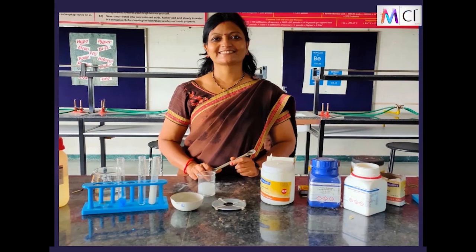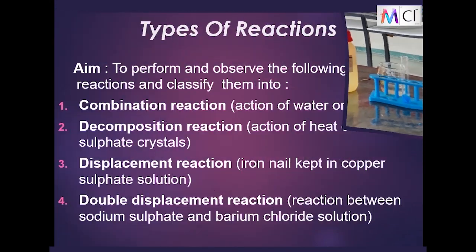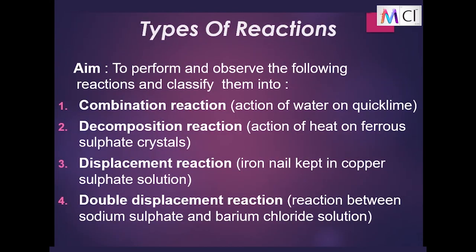In this presentation, we are going to focus on the practicals of types of reactions. These practicals are based on the topic of Chapter 1, chemical reactions and equations. Types of reactions. First let us see the aim: to perform and observe the following reactions and classify them into combination reaction, decomposition reaction, displacement reaction and double displacement reaction.